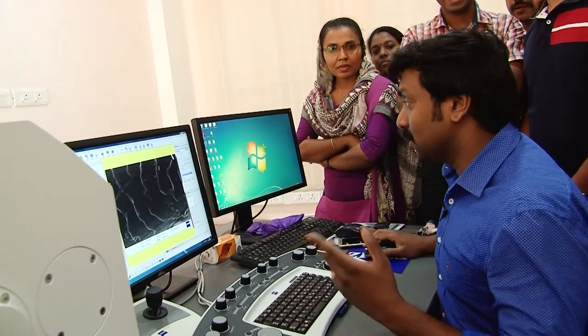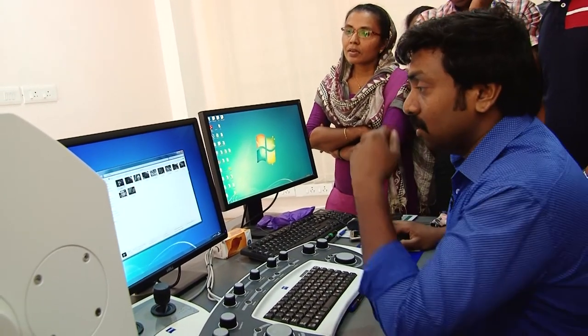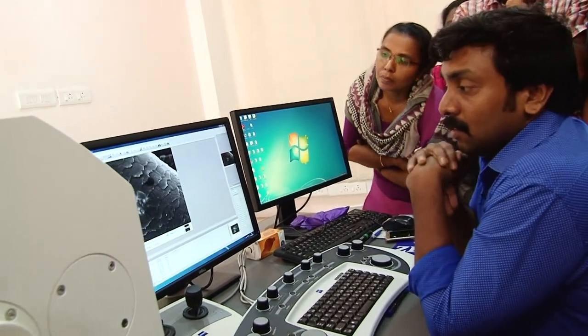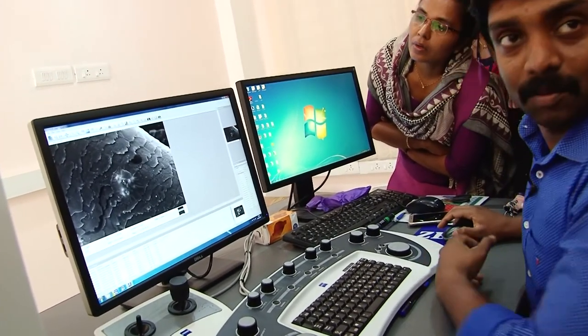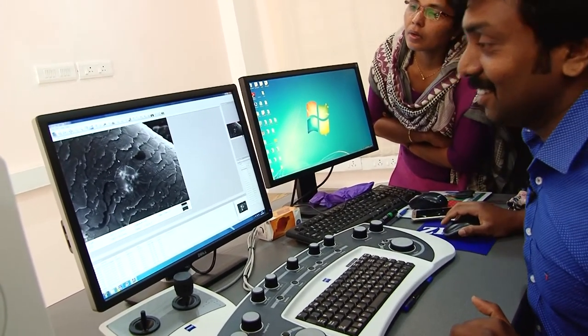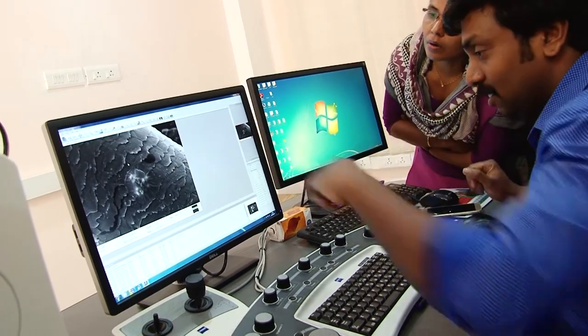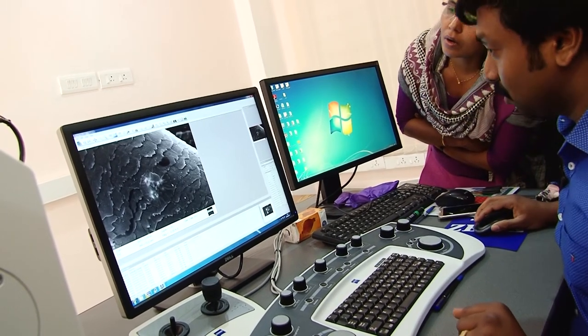I have previously done some hair samples. I will show you. I have seen this kind of thing, I don't know what it is. Ah, this is hair. Around three. Not gray hair. It's normal hair.